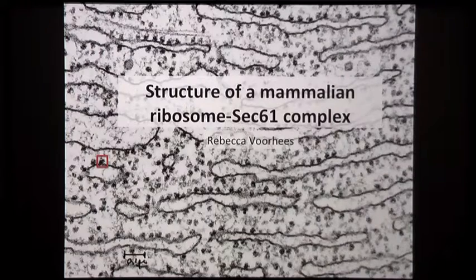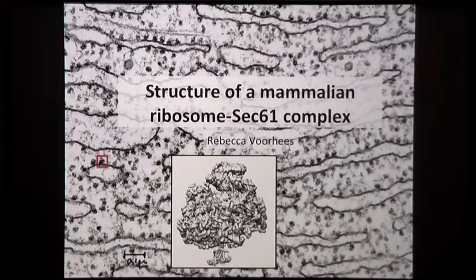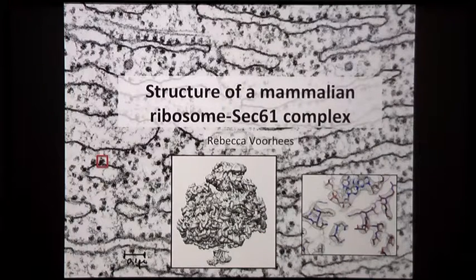What I'm going to tell you about today is how you can take a sample that was made really similarly to this one from 1955 to get a high-resolution EM density map and then eventually a near atomic model.